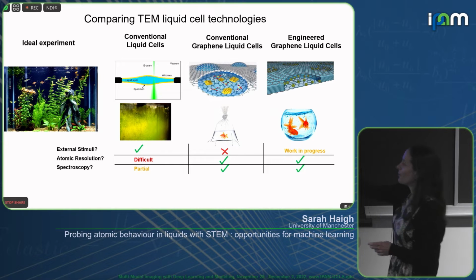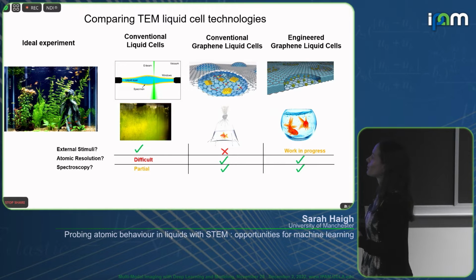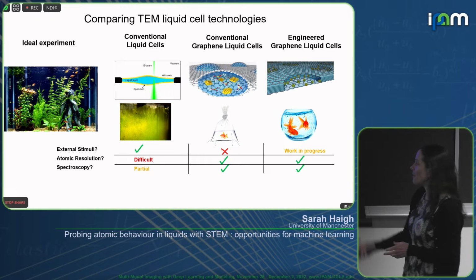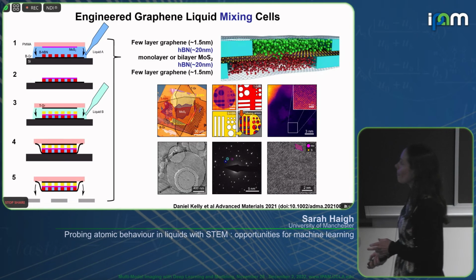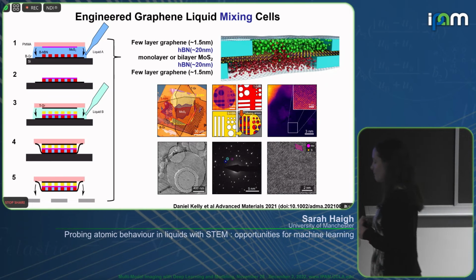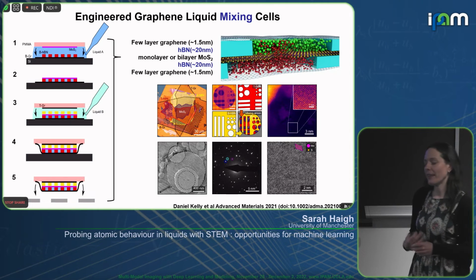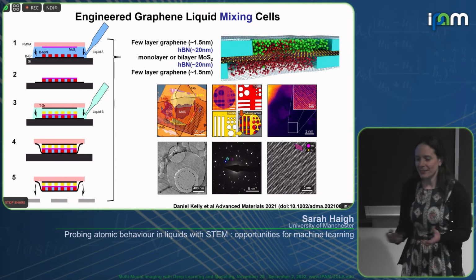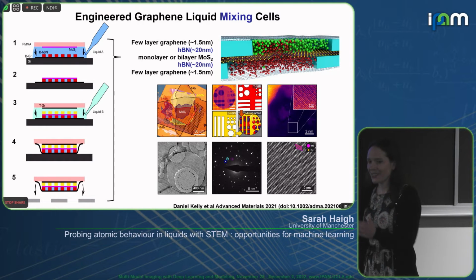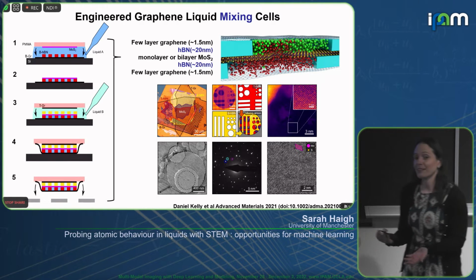Okay, so in summary, we have our conventional silicon flow systems, which do create some really useful stuff. We have the more traditional graphene, and then we have our lithographically patterned graphene cells. And you don't just have to put one layer. In fact, we had a paper with Andre Geim's group a few years ago, where they got an efficiency of a light-emitting diode that was not sufficient to get it accepted into Nature Nano. And so they said, okay, Fred, go away and make 4 of them and stick them on top of each other, and we'll measure the efficiency of that light-emitting diode.